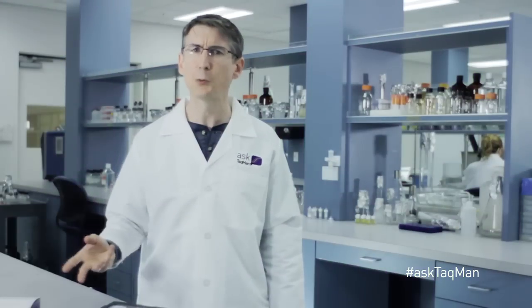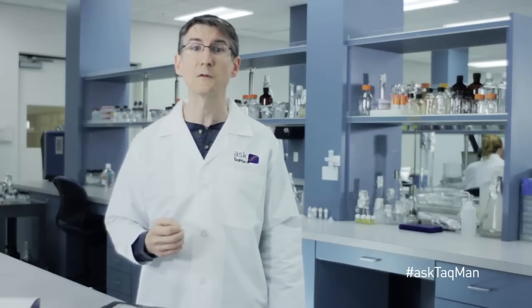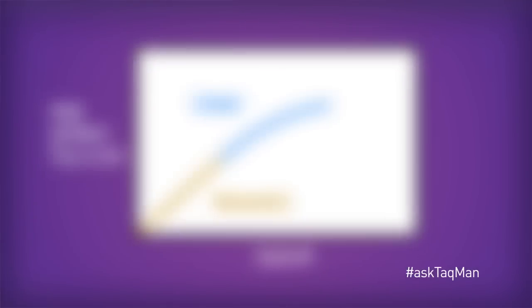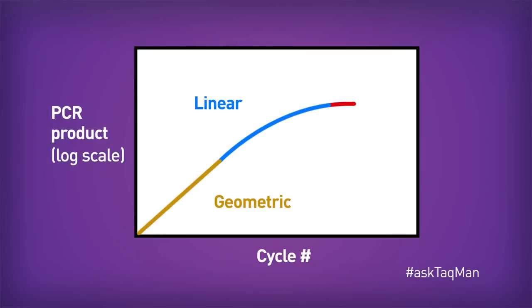Finally, after some point, assuming the plate has run for enough cycles, the reactions run out of some critical ingredient. And as a result, they come to a halt. We call this the plateau phase.